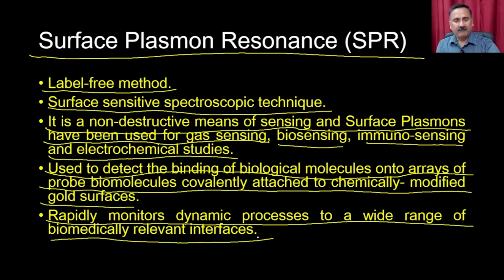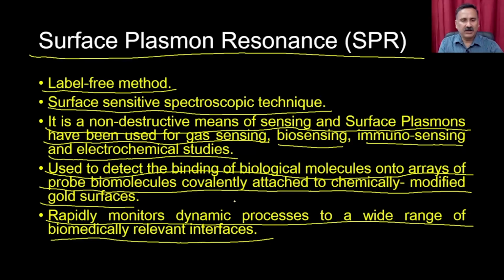interfaces. We'll discuss all this when we discuss in detail the principle of SPR and how SPR can be used to detect enzyme substrate interactions, and then only you will be able to follow some of these terms.